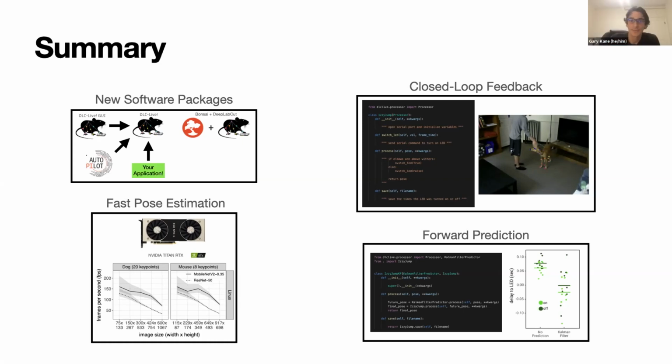So I think it's really going to depend on what these individual frames look like. DeepLabCut is choosing these labels based off of the single image that you provided. So it's only using basically whatever statistics it can pull out from that individual frame. And so if the configuration of limbs and the positions of the body are relatively similar between the videos you're taking of a healthy or control animal versus a motor impaired animal, then it should work just fine.